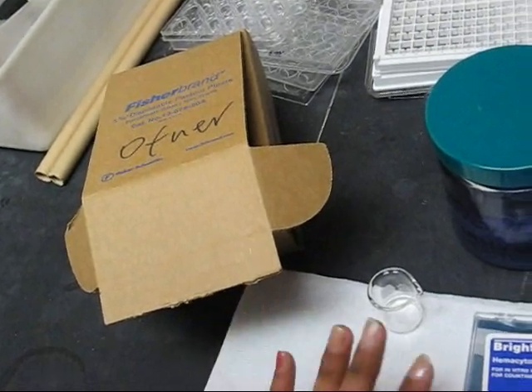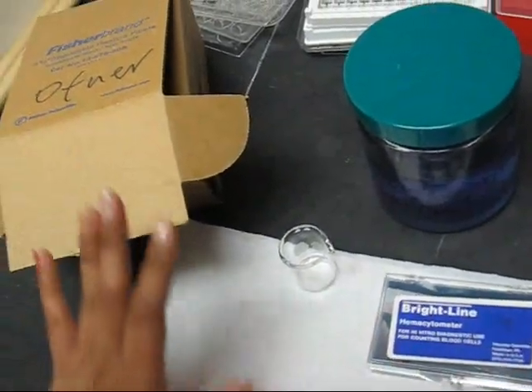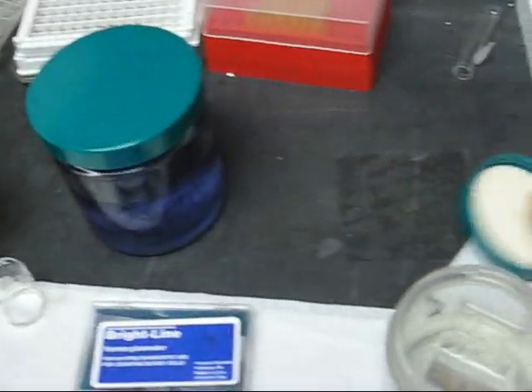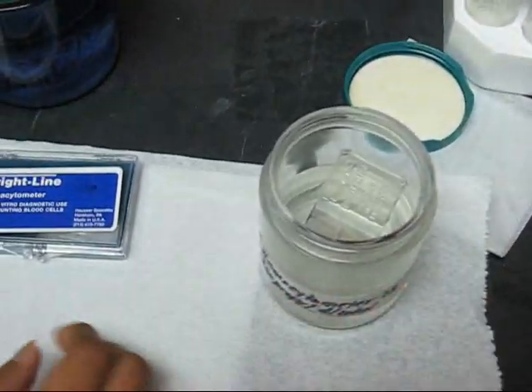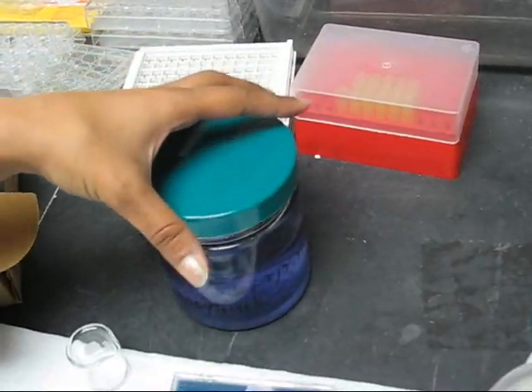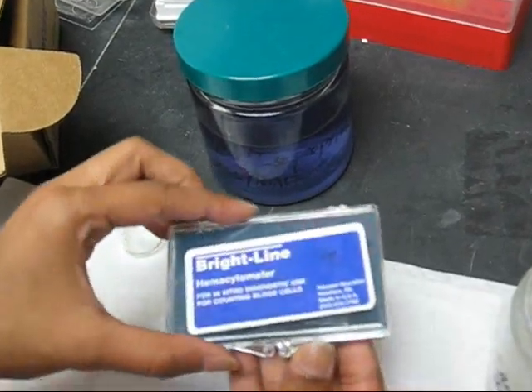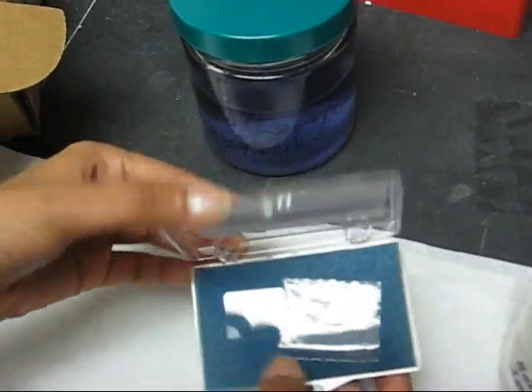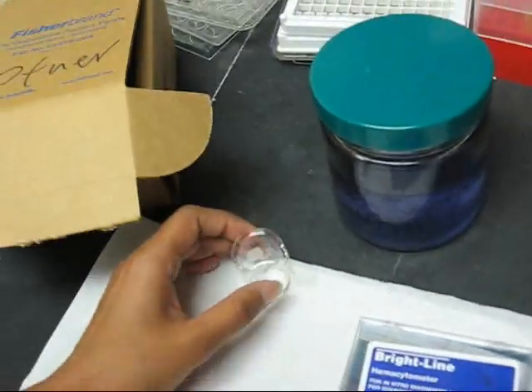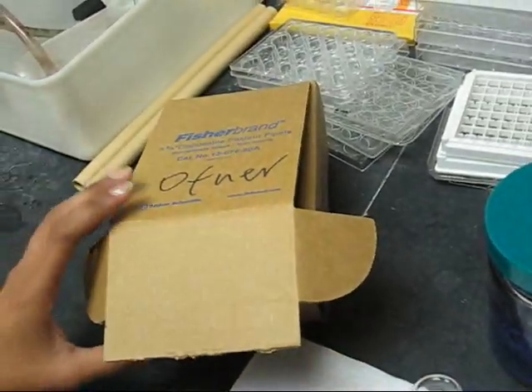To get the hemocytometer ready, you must gather all the materials: the hemocytometer, the waste bucket for the isopropyl, the top slide for the hemocytometer, a glass slide, a small beaker of water, and some Pasteur pipettes.